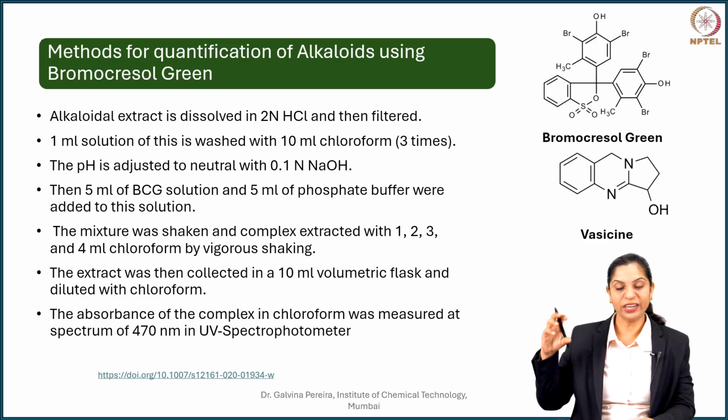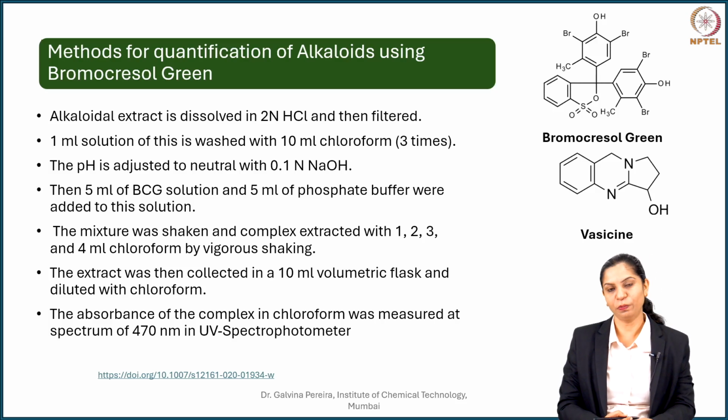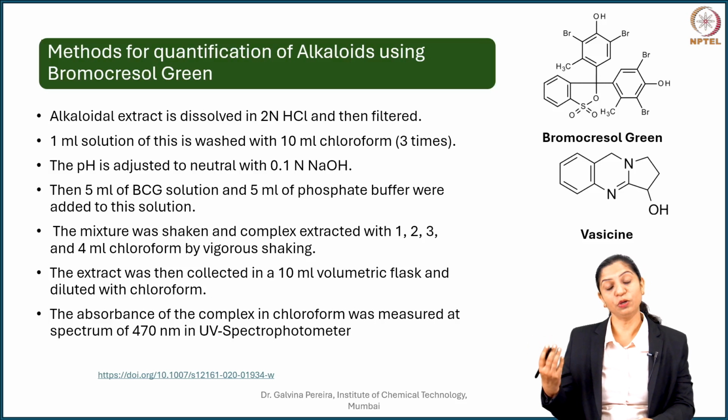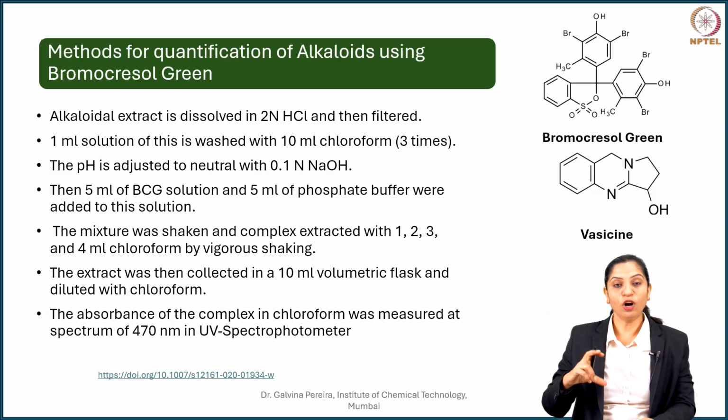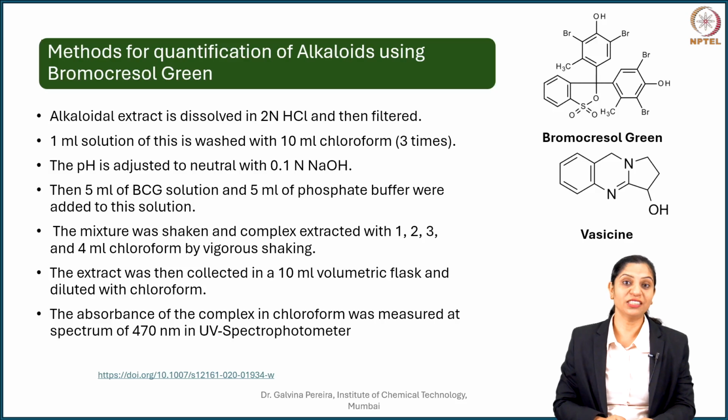Now this alkaloidal salt solution is filtered, collected and washed with chloroform. The reason for this is alkaloidal salts are not soluble in organic solvent. But imagine if you have an adulsa leaf. The adulsa leaf will have pigments such as your xanthophyll, chlorophyll, and all of them are lipophilic and soluble in chloroform. So the moment you take this extract, that is your 2N-HCl extract, and partition it with chloroform, majority of your pigments will get transferred to the chloroform. So wash it as much as possible so that all the pigments are gone and your chloroform washings are colorless.